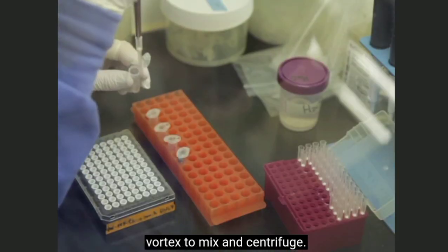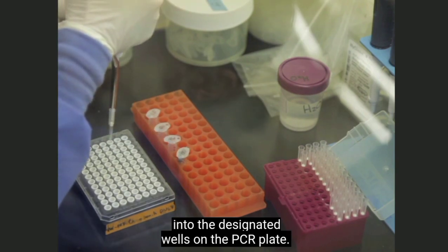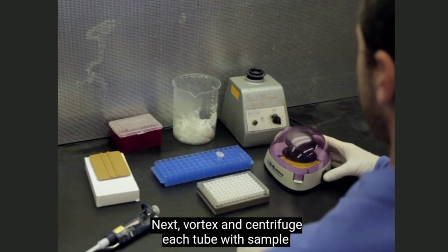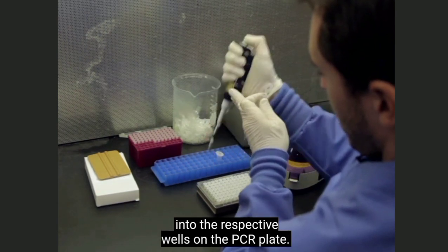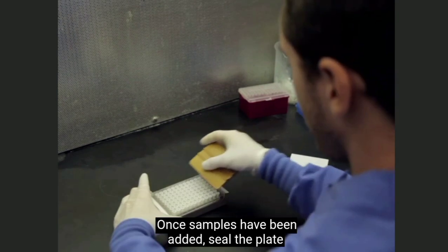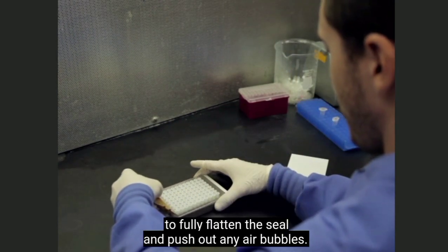Then, aliquot the appropriate amount of master mix into the designated wells on the PCR plate. Next, vortex and centrifuge each tube with sample and control DNA, and pipette the appropriate amount into the respective wells on the PCR plate. Once samples have been added, seal the plate with a sealing foil, and use the sealing tool to fully flatten the seal and push out any air bubbles.